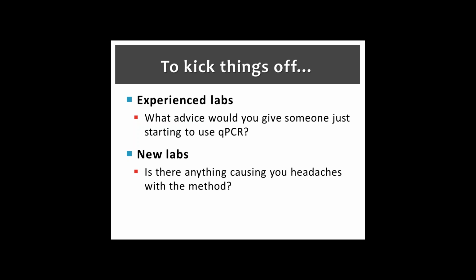And I know maybe you guys want to talk about this. I realize there is a method and a number for qPCR for enterococci, but it doesn't work that way for E. coli. And Rich, you're going to talk about that this afternoon quite a bit. You want to come up here, or Kevin, or Rich, or John? Put you guys on the hot seat.